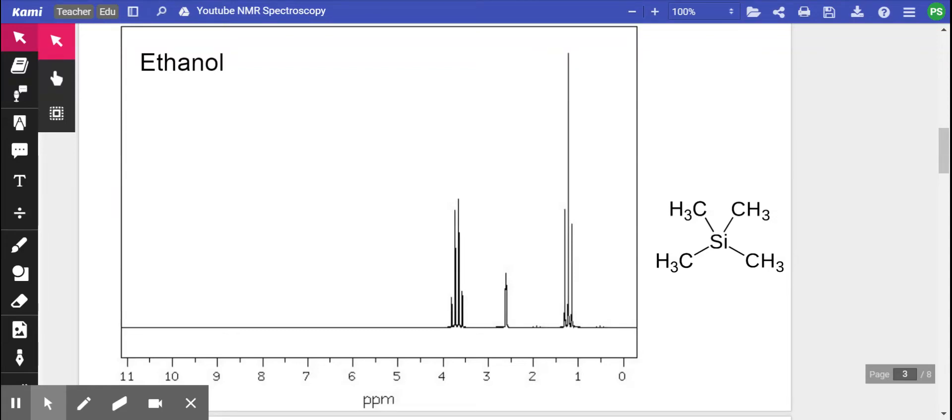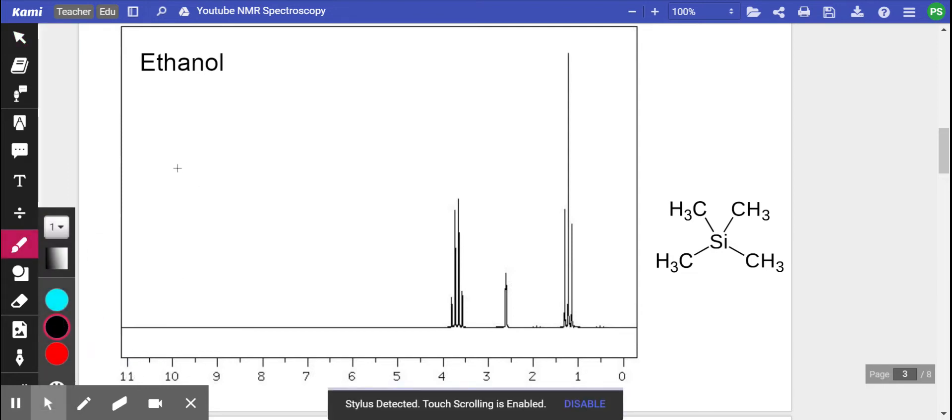Okay, welcome to part two where we're going to continue analyzing NMR spectroscopy. Now we left off looking at this spectrum of ethanol, so just to get started let us draw ethanol out to see how many hydrogens there are and how they differ and appear in different places.